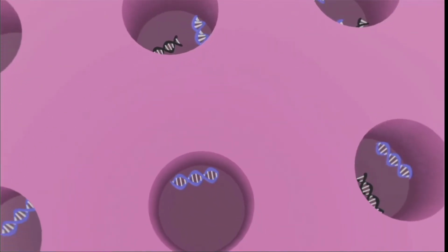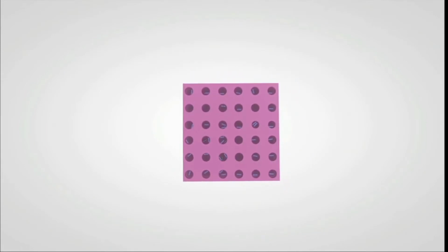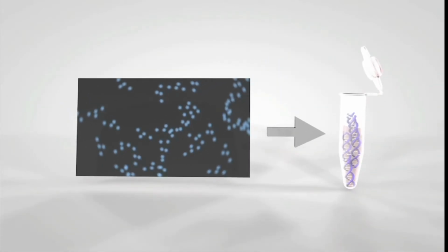Digital PCR starts with the partitioning of your reaction mix into hundreds to thousands of independent PCR replicates. Some partitions receive the nucleic acid sequence of interest and others do not. Partitions with a target molecule will amplify via PCR to a detectable level. These are categorized as positive reactions. Partitions without the target molecule will read as negative reactions. In the end, the number of positive reactions is directly proportional to the total number of molecules present in a sample, enabling an absolute count to be established.